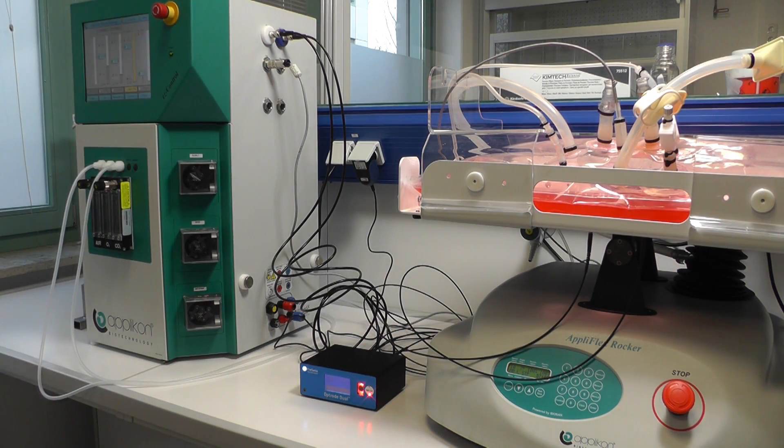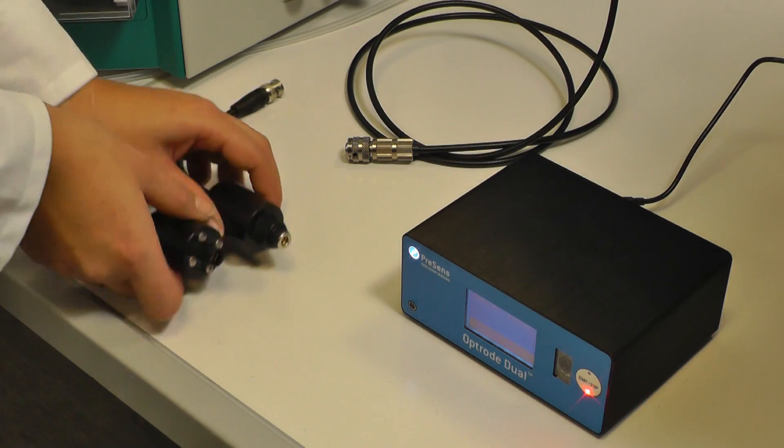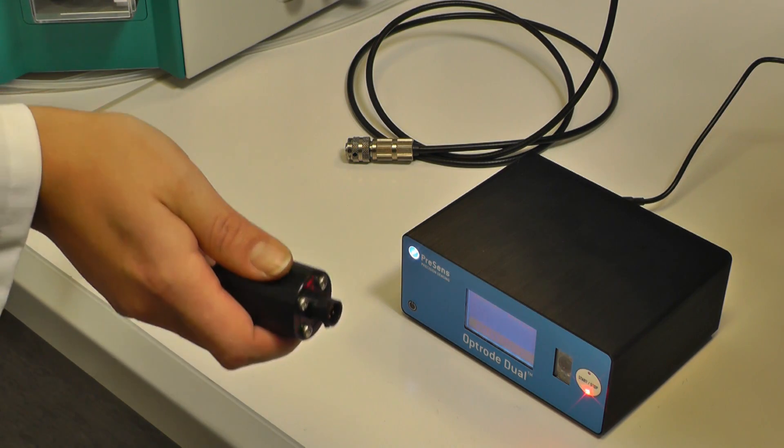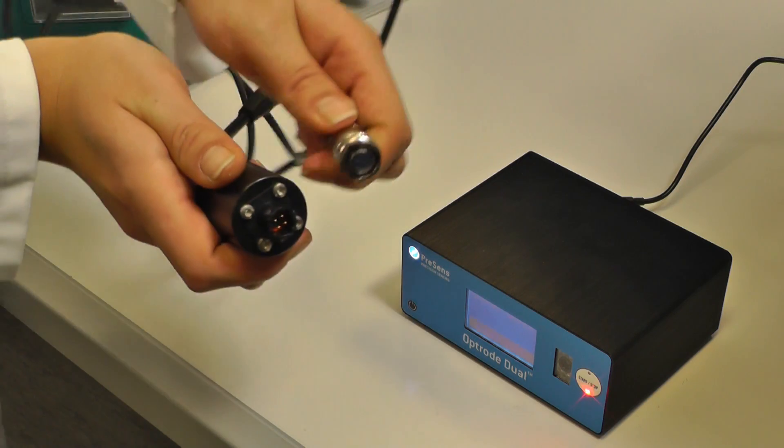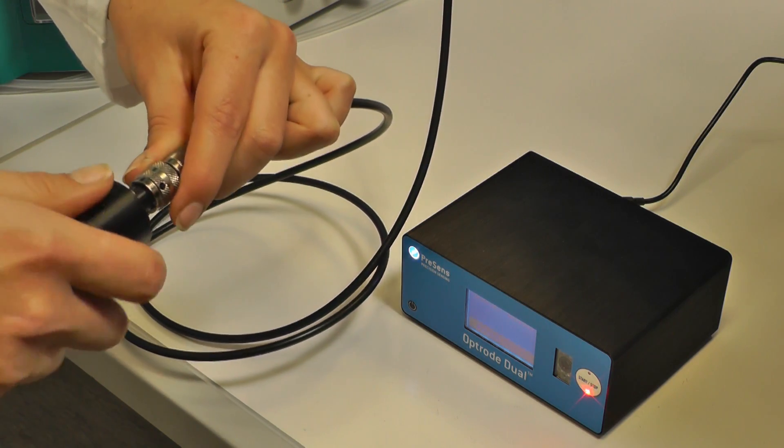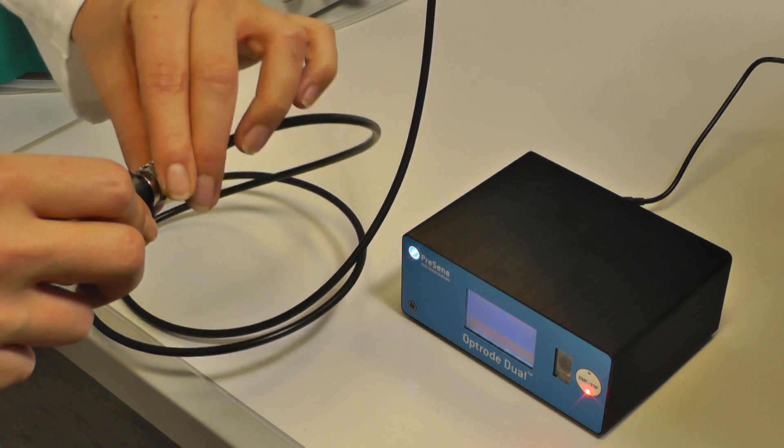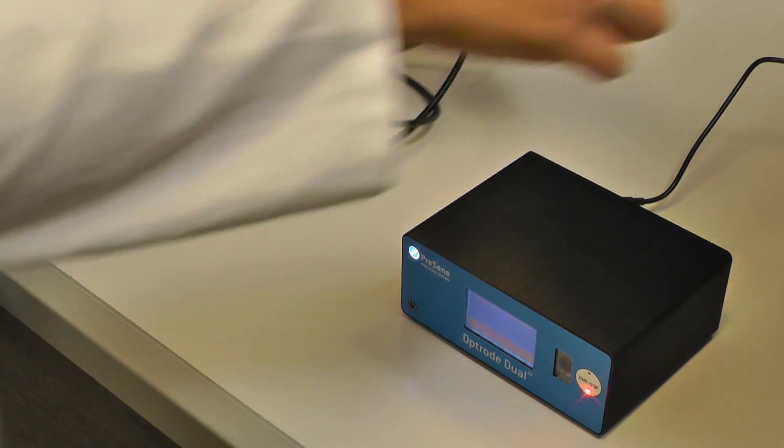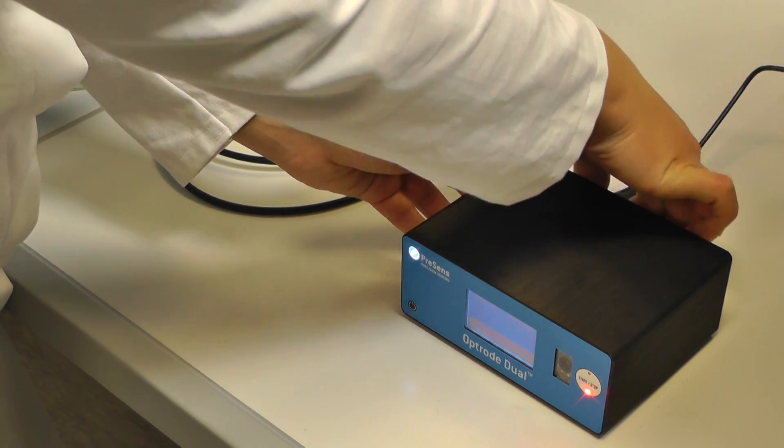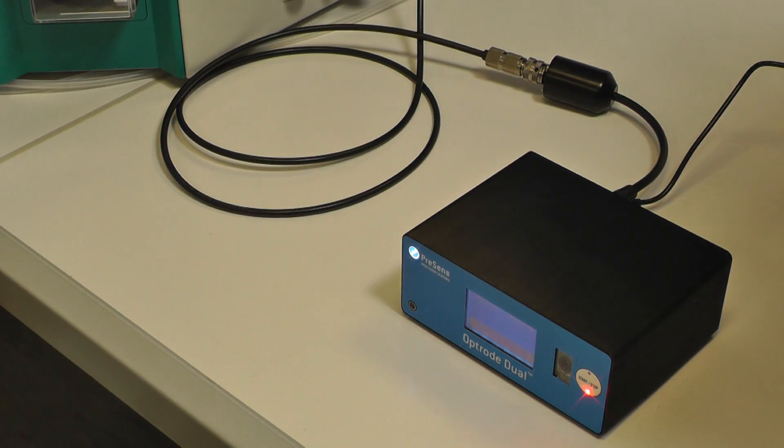For all other controllers which do not have BNC connectors for DO and PH input, PreSens supplies special adapter cables for PH and oxygen. Here we show how to connect the adapter for oxygen. Connect the respective electrode cable to the oxygen input on your controller and to the adapter cable as shown here. Then connect the adapter to the connector on the Optra Dual back panel.